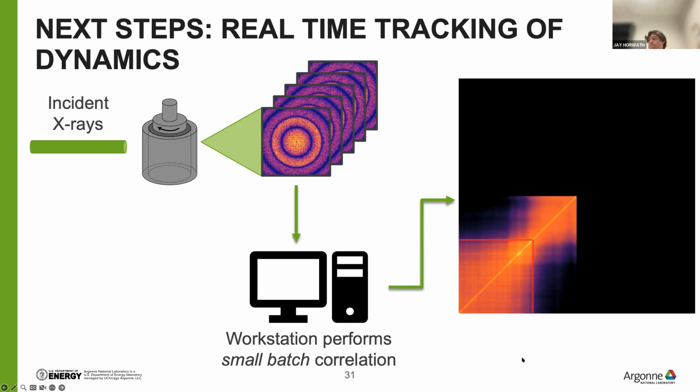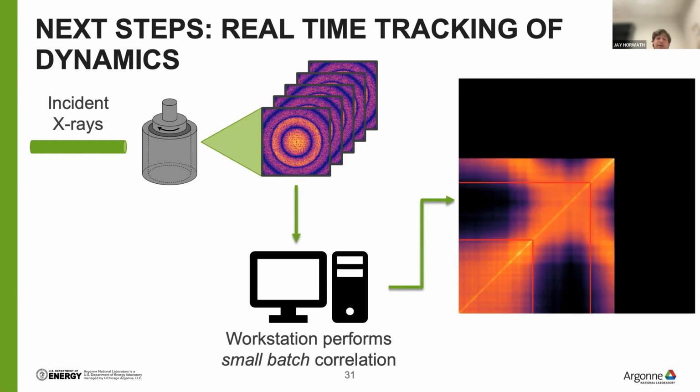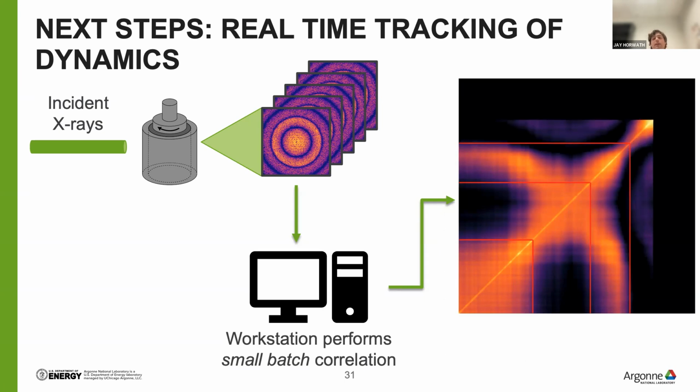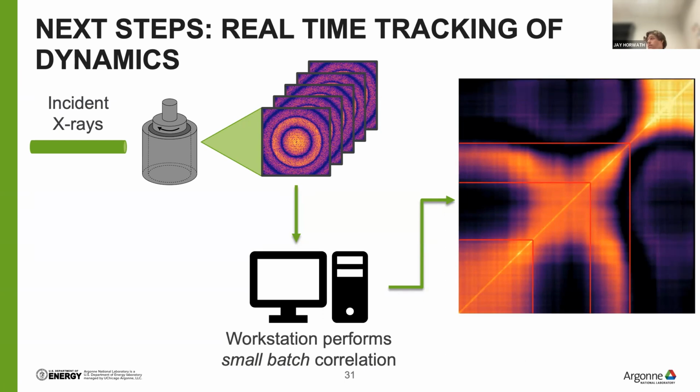and be able to capture these as they occur. And so the benefit to this would be if you have slow dynamics and then all of a sudden you see something happen very quickly, then maybe you can change the frame rate of the camera, for example, so that you don't miss any information. Or even for the simplest case of this data takes a long time to go through after you collect it. So if we can at least understand where the transitions occur ahead of time, then it eases the analysis once you sit down at the computer.